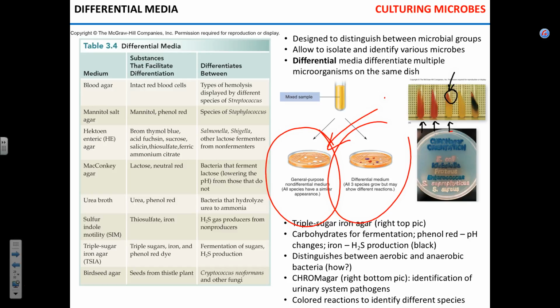Okay? This is either an aerobic microbe or an aerotolerant anaerobe. So the guy that doesn't use oxygen but can grow in its presence. So you can tell apart. And finally, this is the sulfur reducing bacteria. The same example that I gave you before, okay? When microbes reduce sulfur, it produces sulfide ion.